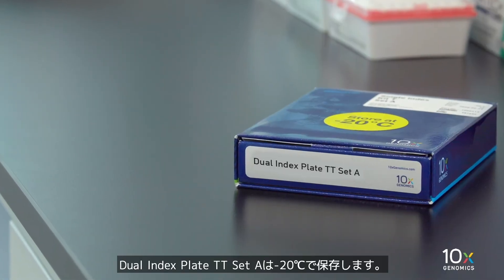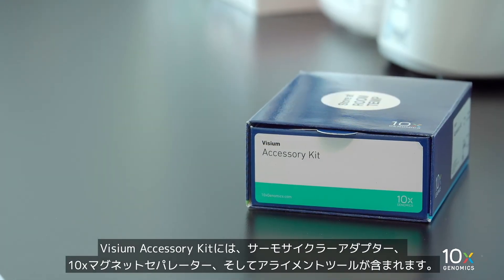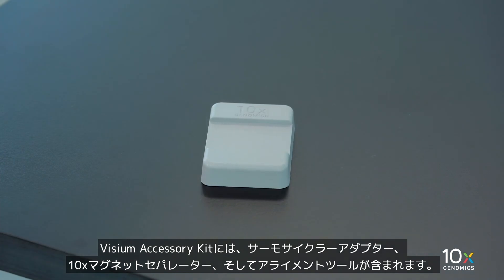The Dual Index Plate TT Set A is stored at minus 20 degrees Celsius. The Visium Accessory Kit includes a Thermocycler Adapter, a 10X Magnetic Separator, and a Slide Alignment Tool.